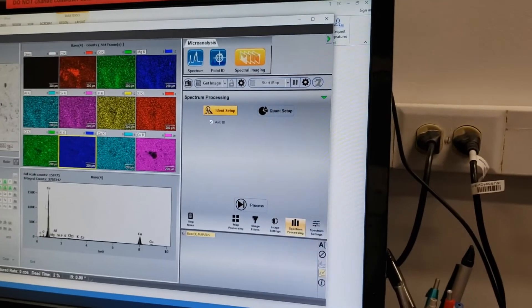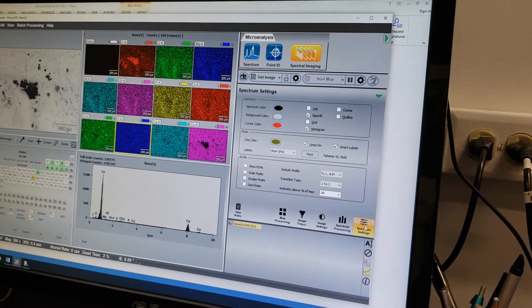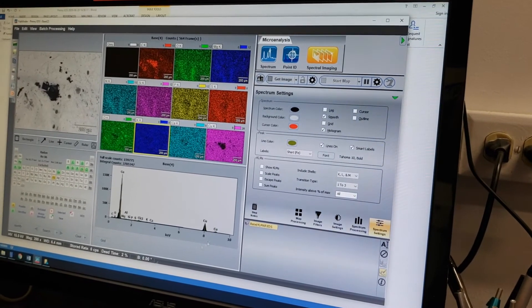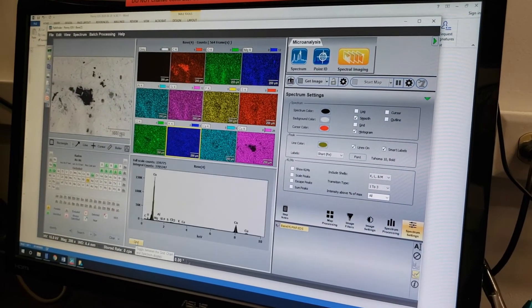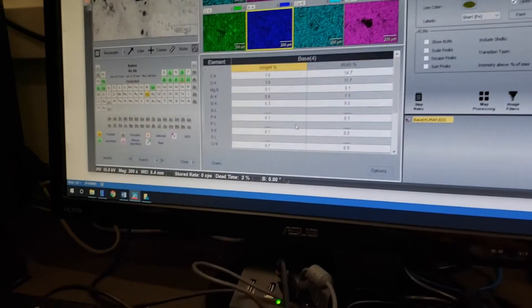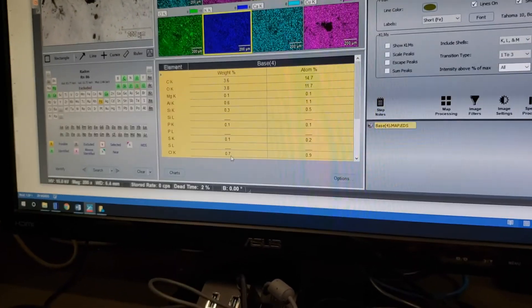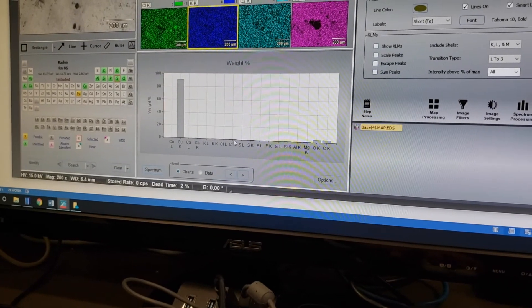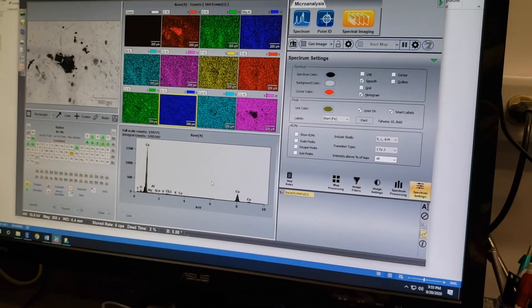Spectrum Processing here relates to the graph we created — you can modify what it's doing there. Spectrum Settings lets you turn the cursor on or off and show or hide KLMs. By default it shows the spectrum, but you can click through to view weight percent table or charts. The charts view shows weight percent, and you can see everything is extremely low except for copper, which is entirely unsurprising.